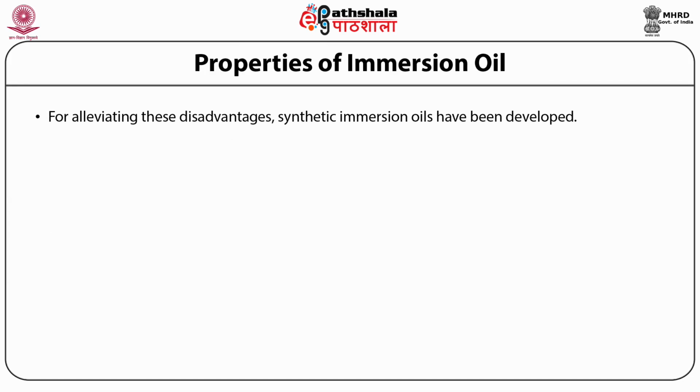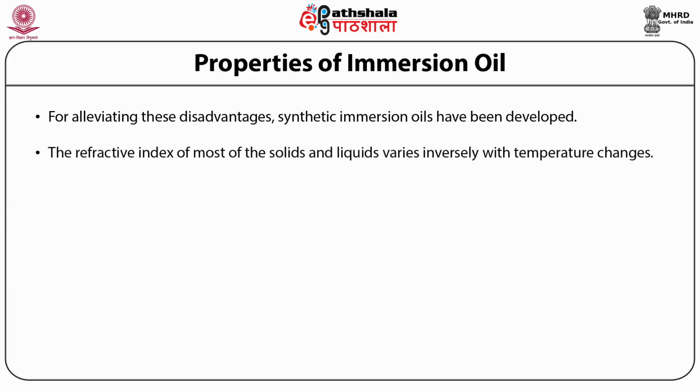Another factor which impacts the performance of immersion oil is temperature. The refractive index of most solids and liquids varies inversely with changes in temperature. Thus, the packaging indicates the temperature at which the oil has been adjusted.